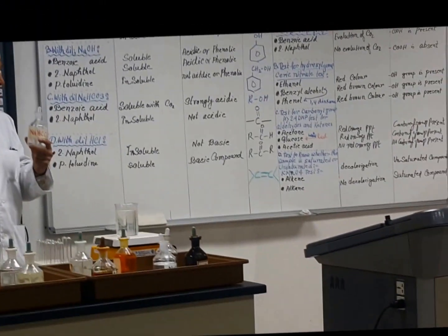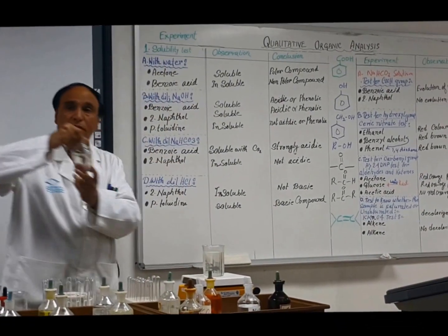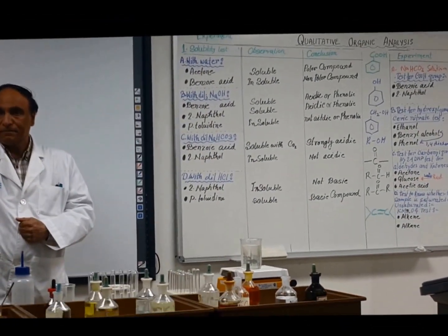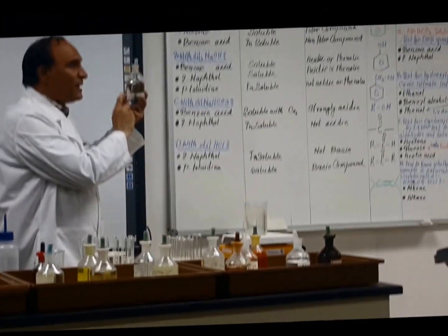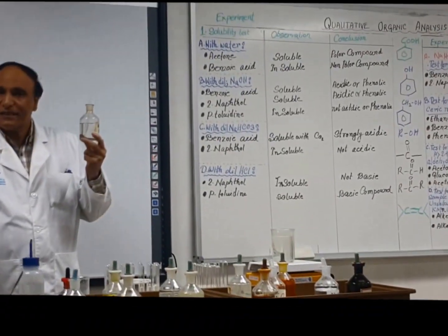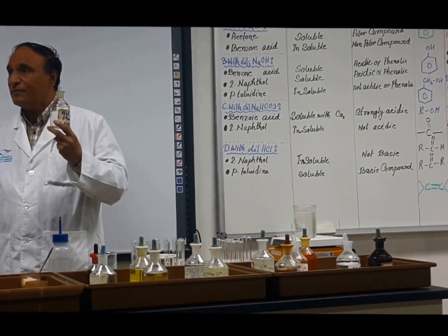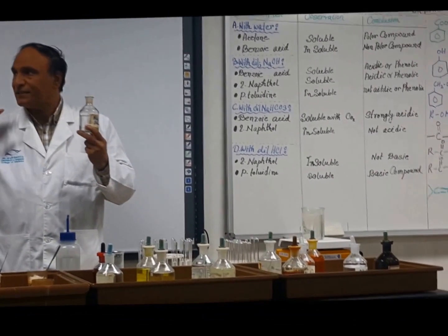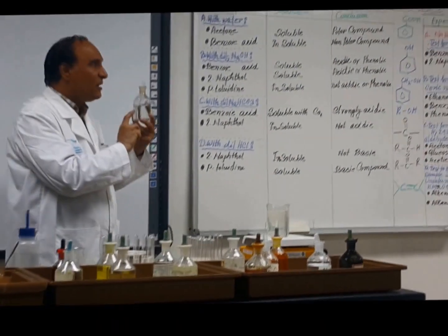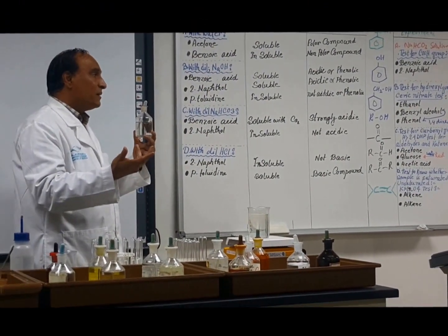Did you understand? Then I will check the solubility in hydrochloric acid. This is an acid. Any substance which dissolves in acid will be basic. And any substance which does not dissolve is not basic. We will not say acidic, we will not say something else. Any substance which dissolves is basic, and a substance which does not dissolve is not basic.